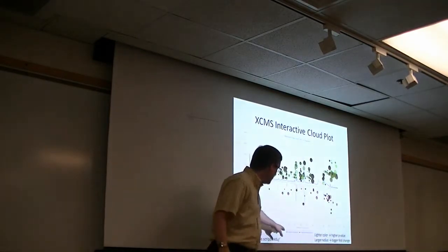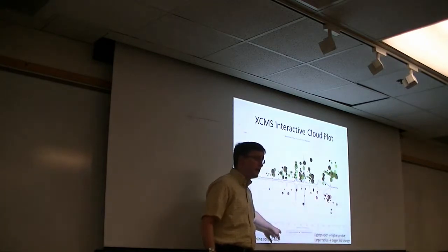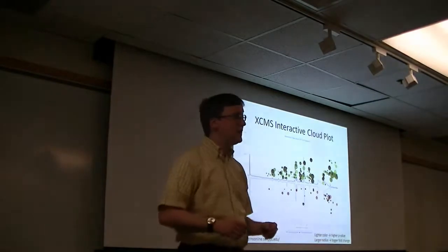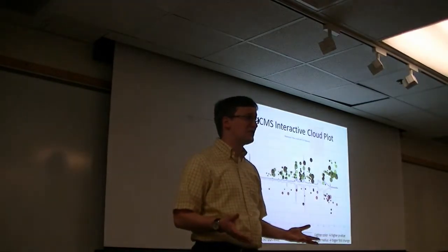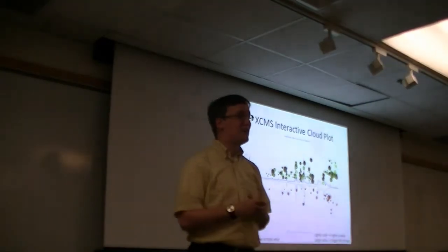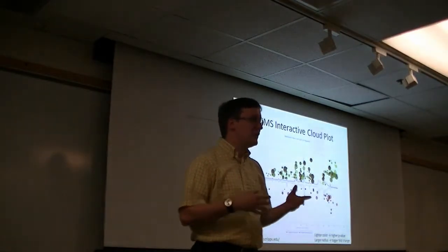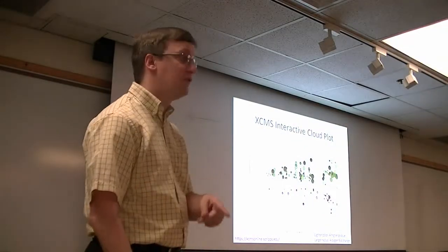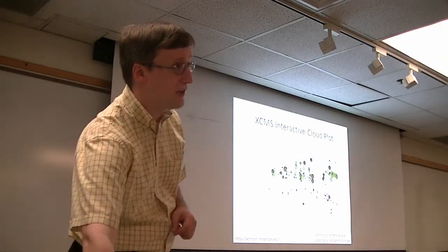All right, so you have a lot of options to modify how this is visualized as well within the user interface. It's very valuable. Now, we're not going to be producing any of those in the hands-on session because those are not what we're generating. We don't have the cloud plot software installed here. But these are all accessible if you've done your workup within the XCMS Online site.